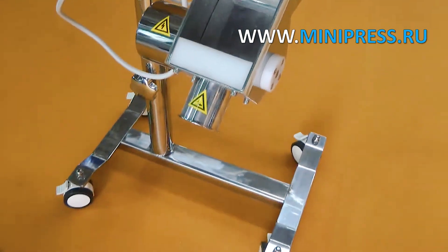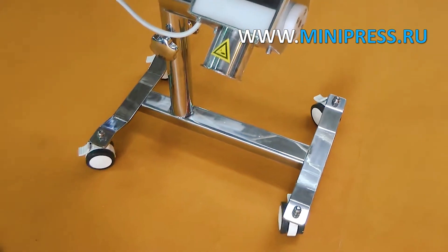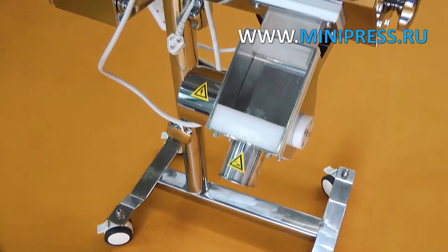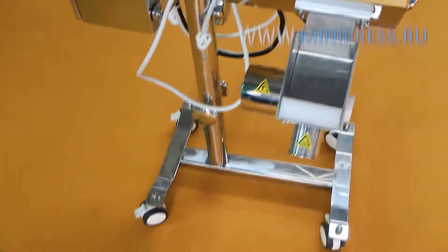Made according to GMP standards in SUS-304 stainless steel. We provide detailed instructions for setting up the metal detector. The equipment is inspected and tested at the factory before being shipped to the customer. Complete set and working order is guaranteed.